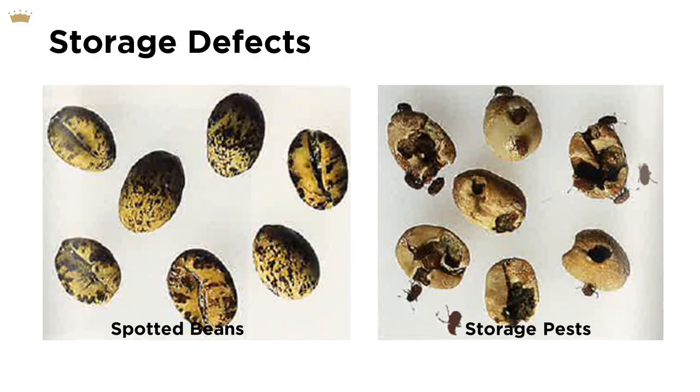Hot and humid conditions can exacerbate aging. In especially wet conditions, coffee might reabsorb water and fade in appearance as well as flavor. Black spots can occur if the coffee's been poorly dried, and pockets of water within the bean rot. And of course, mold can develop on the surface of the coffee as well. Stable storage conditions will help prevent these defects easily.